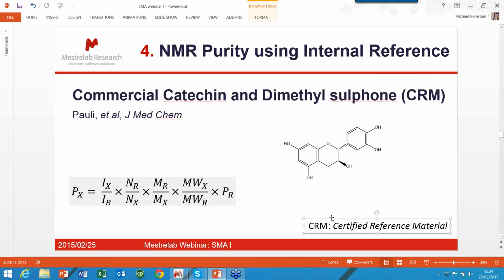And there are many government agencies and so on that worry about these hugely. And so it's a very well underpinned area in which to work, and using NMR in this way to determine purities, which was really kind of the message that I showed you on that slide from the editors of Med Chem. This is really a very sensible way to go about determining purities.